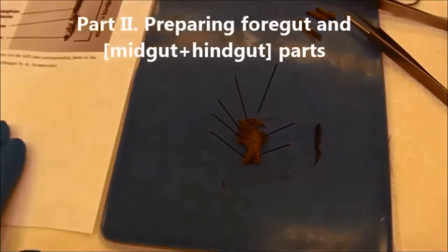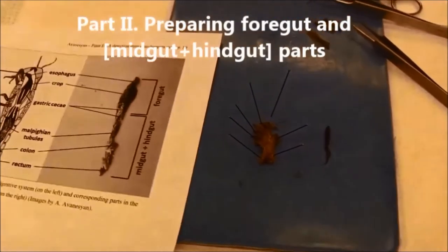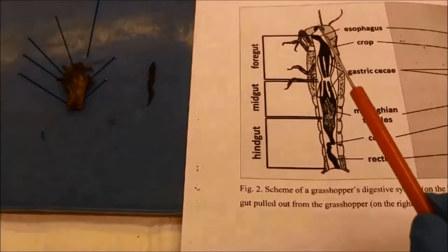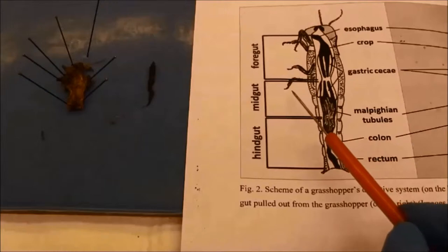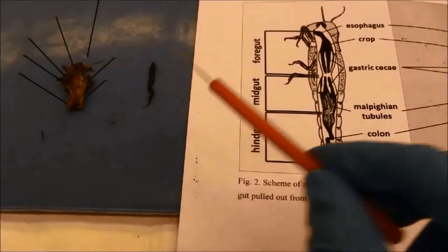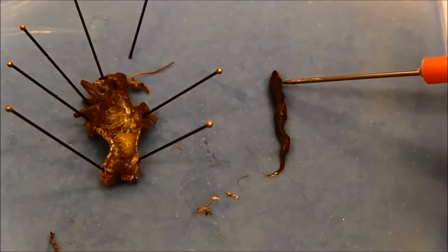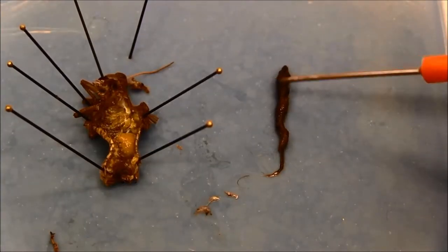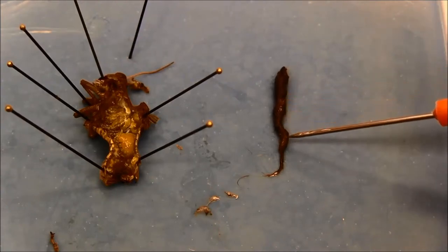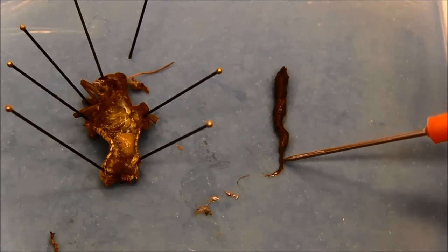To prepare different parts of the gut for DNA extraction, I need to review the scheme of a grasshopper's internal structure to match the main parts of the digestive system. The foregut includes the buccal cavity, pharynx, esophagus, crop, and proventriculus, after which the midgut begins.